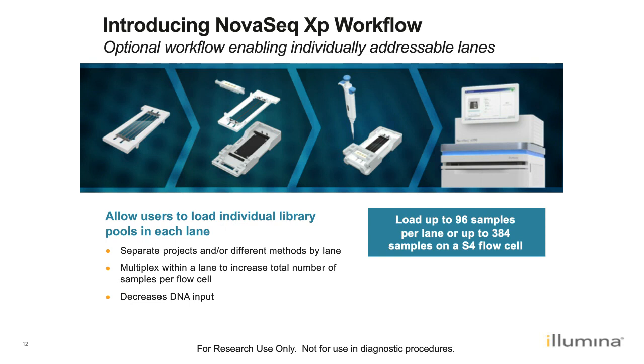So some of the highlights of the new kits are that we've increased the number of cycles of SBS. Currently our kits have an overfill of 30 cycles for indexing and dark cycles, but the new 1.5 reagents will have an overfill of 38 cycles of SBS. So for example, your 100 cycle kit will have 138 cycles of reagents. We've also released a new version of Illumina Experiment Manager for creating sample sheets. This will help with some of the indexing changes that we'll talk about on the next slide.